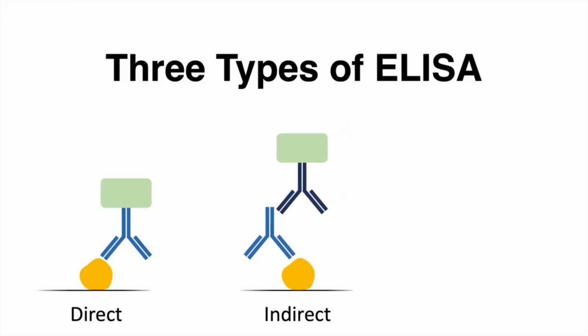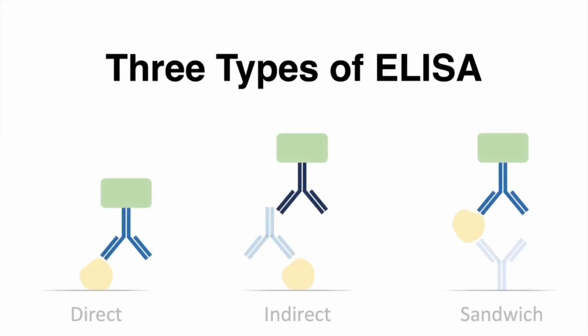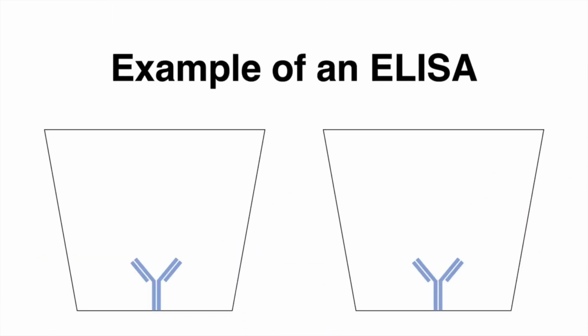Primary antibody or antigen is immobilized on the surface of the microtiter plate. After the surface is blocked with other protein to avoid non-specific binding and absorption of other proteins, the corresponding enzyme-labeled antibody or antigen is allowed to react with the immobilized target, followed by color development with appropriate substrate. As the amount of target increases, the signal increases. Direct ELISA is suitable for the quantitative analysis of macromolecules.